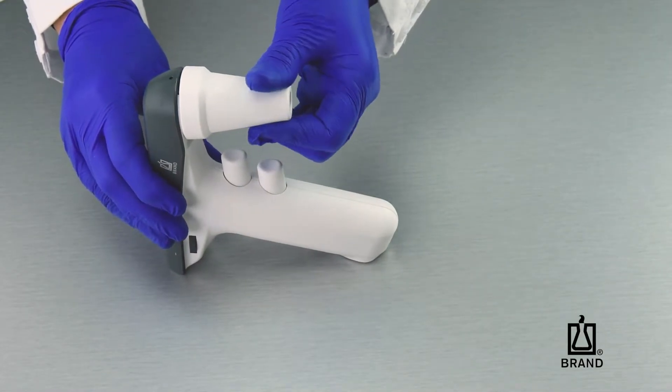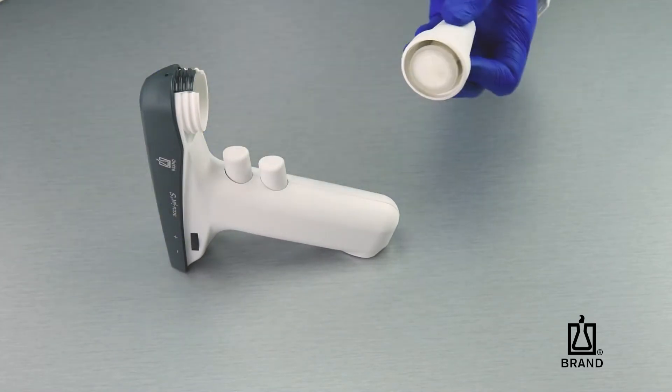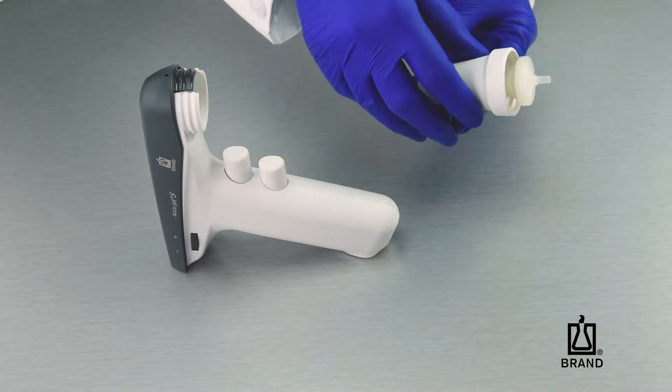Start by unscrewing the adapter housing. Once the adapter housing is removed, push the silicone adapter and the filter out by pushing up from the bottom of the adapter housing.